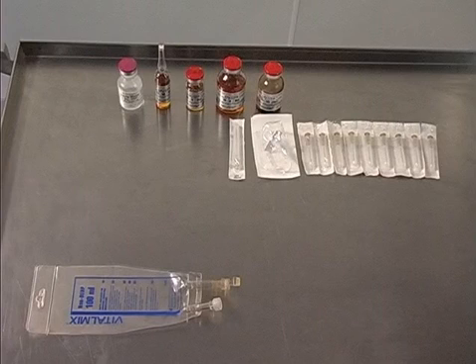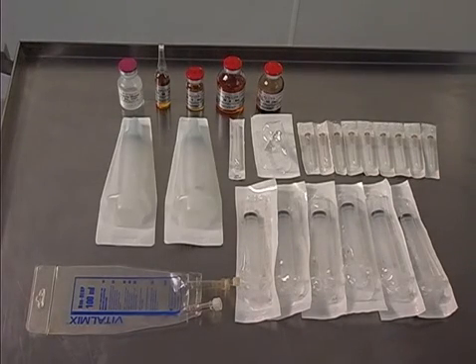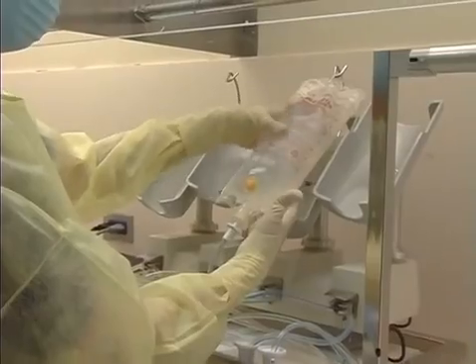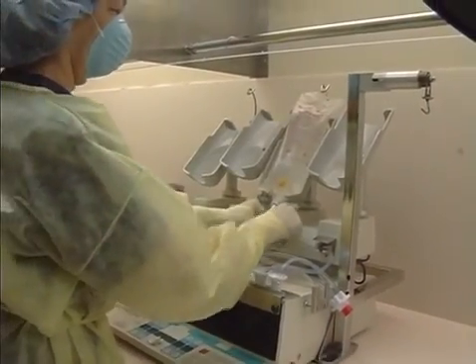Also place the following syringes onto the critical work surface: six to ten 10-ml syringes, two 20-ml syringes, and one 30-ml syringe. You will also need an automated compounder set up with sterile water for injection, or a Y-set in a bag of sterile water for injection. And a 150- to 250-ml empty sterile bag or evacuated bottle as the final container.